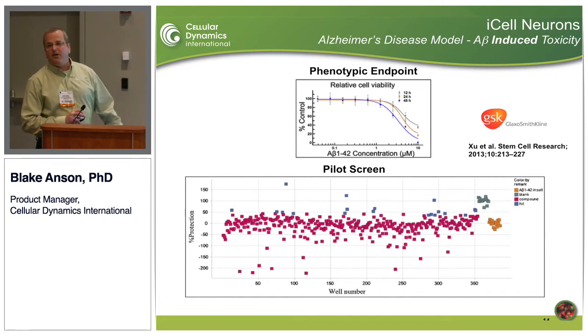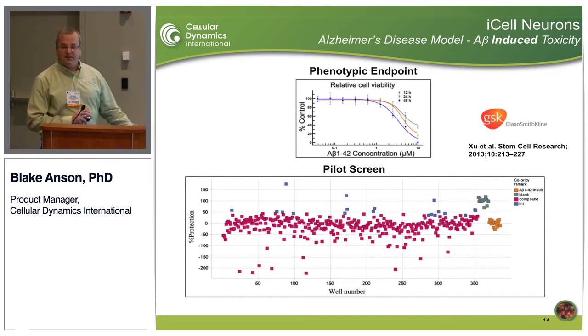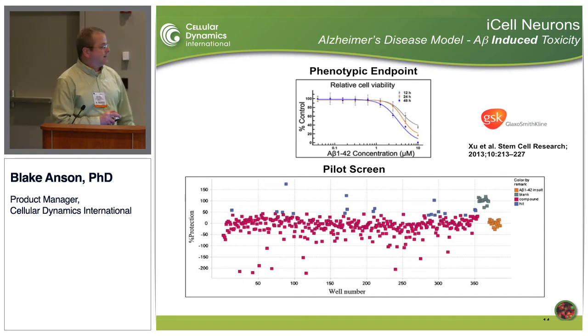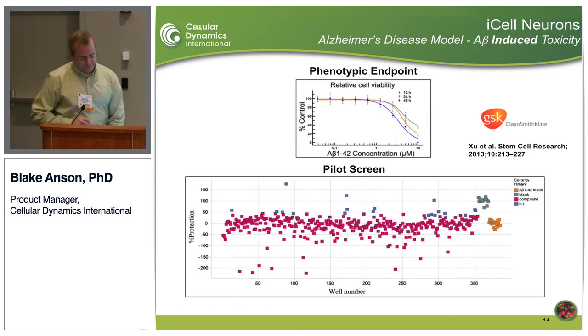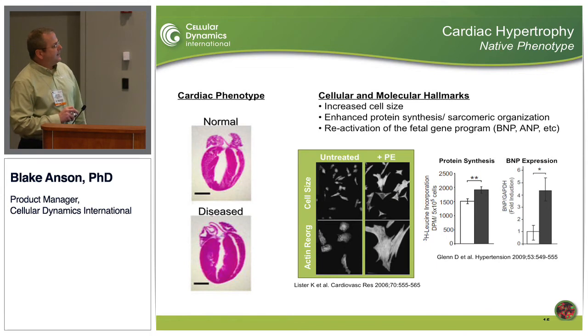They were then able to follow up with a variety of techniques such as siRNA for knockdown. This work was published a couple of years ago, and as far as I know, is still being worked on within GSK.